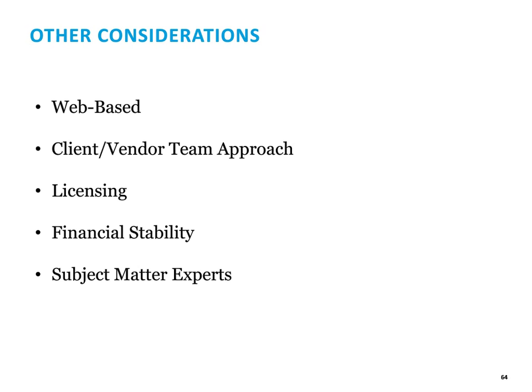and understand and speak the same language that you do? That's also very important and really can go a long way to mitigating communication challenges when you have laboratory personnel trying to explain their requirements. Very helpful if the vendor has people who speak that language.